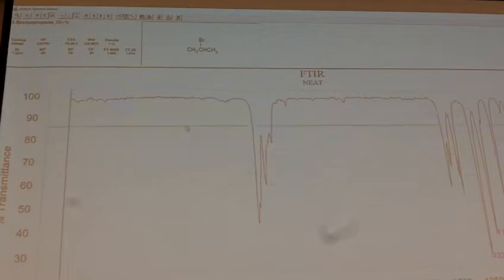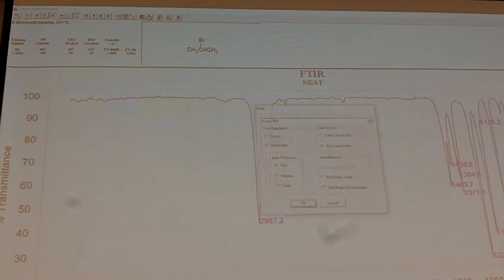You move the threshold up and down, and whatever's below it will get marked. So you just left mouse click, and then whatever is below it is going to get marked. And then if you decide this is the thing that you're looking for, you'll click on print. Make sure that print peaks on spectrum is selected, and then we would say okay to print it, okay?